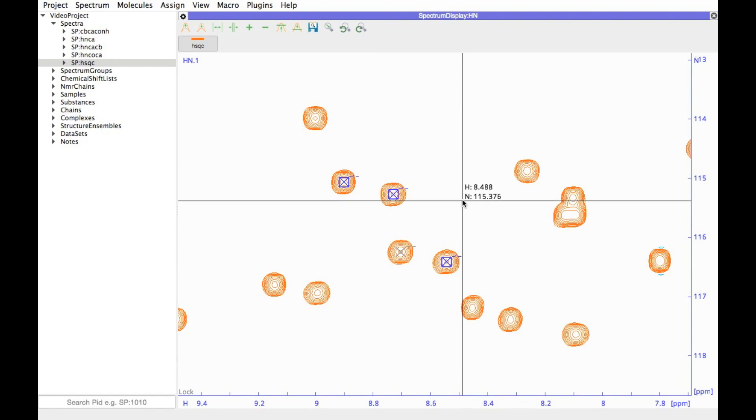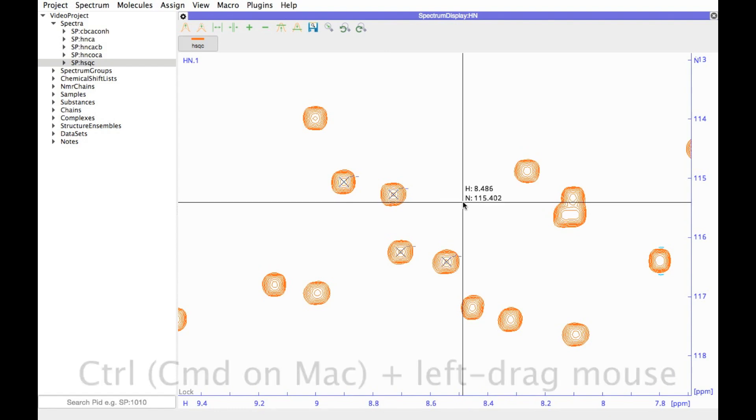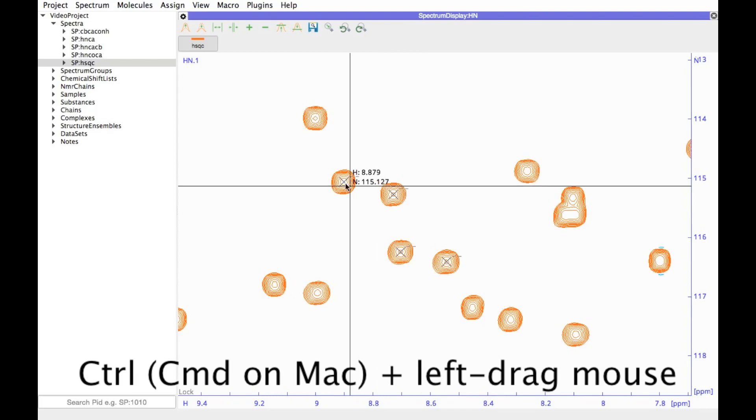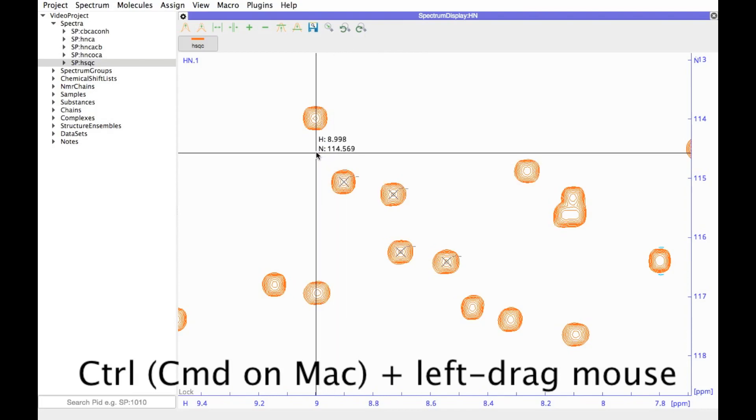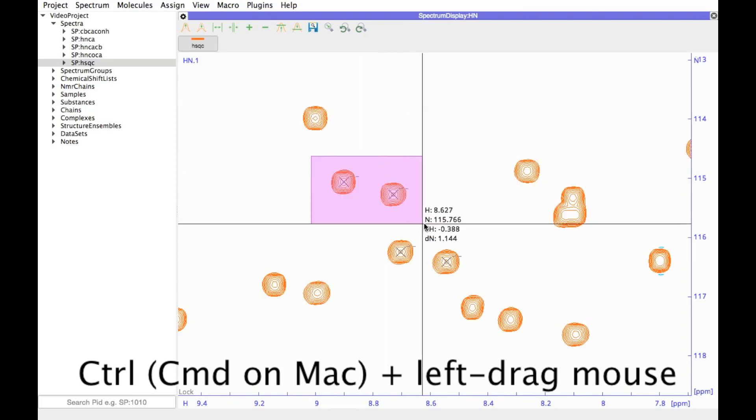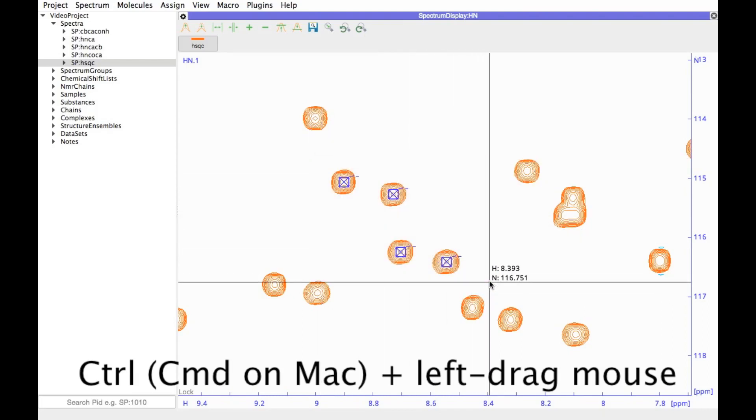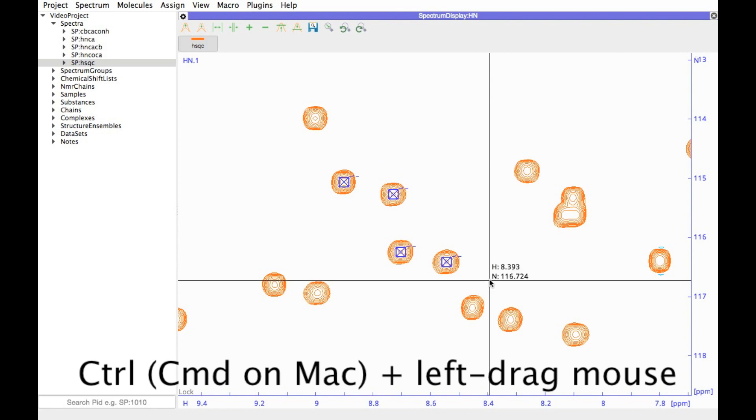If you want to select items in a whole area, again hold down the control, or on a Mac the command key, draw a box. This time it will be pink, and all the items in that area will be selected.